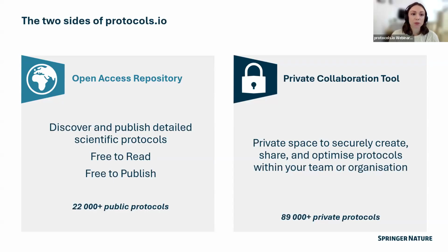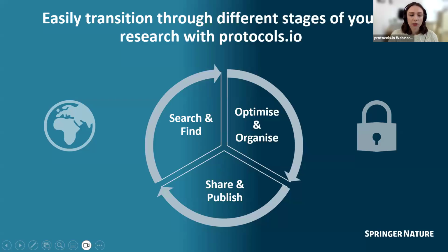And then there's the other side of the platform, which is a private collaboration tool. So that is the paid side of the platform. You still can take advantage of it to a certain extent with the free account. But the free account is really built for open protocol sharing. And so those two sides of the platform really feed into one another.